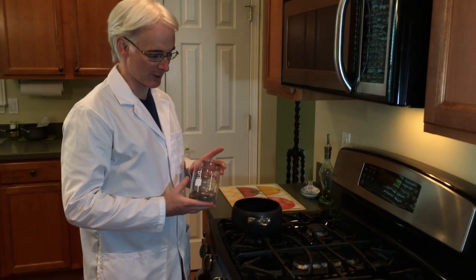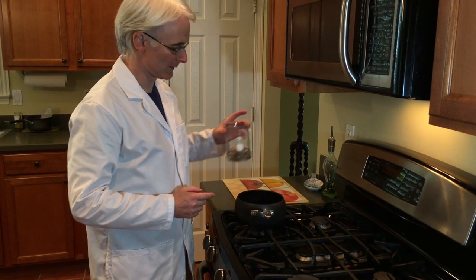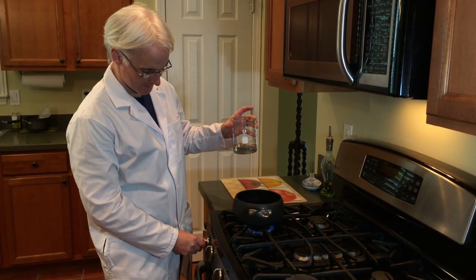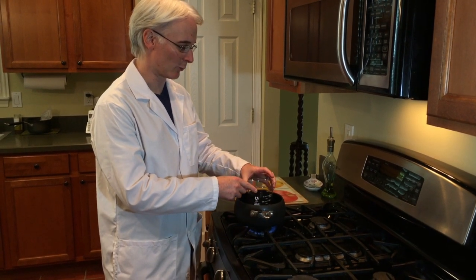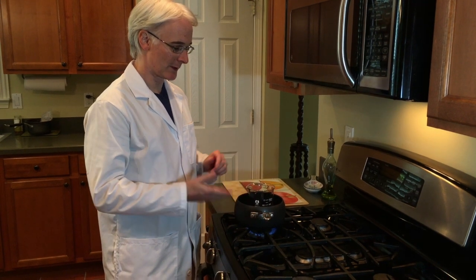So now we have our beaker with the steel wool in. We're going to turn on the heat. Put the beaker into about 1 inch of water. You're going to let this simmer for about 45 minutes — don't let it boil actively, just get it simmering. You want to reduce it down to 50 milliliters, and that will give us the iron 2 acetate that we're looking for.